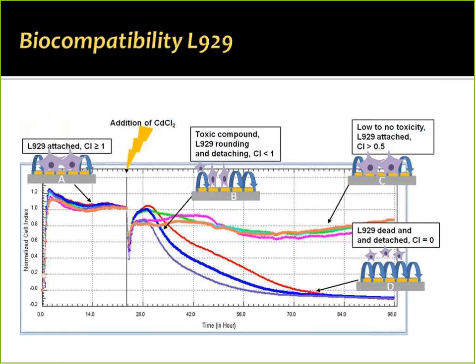So to give you an idea of how the xCELLigence cytotoxicity assay looks, and I think that Lena explained earlier that there are really over 500 peer-reviewed articles from different laboratories that have used the xCELLigence for various purposes, and several of those published articles really detail how cytotoxicity is tested.